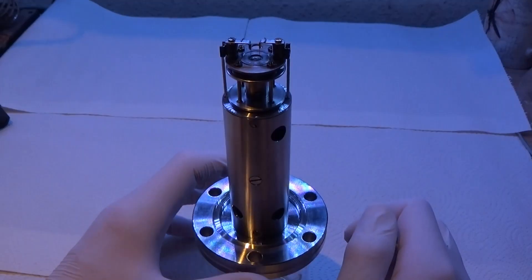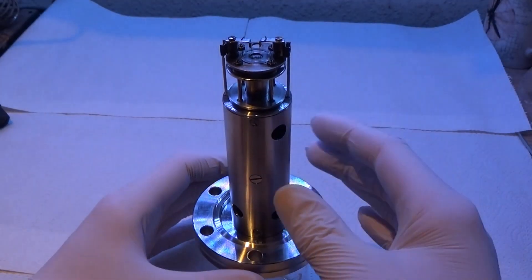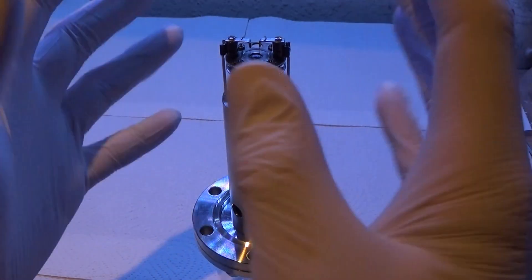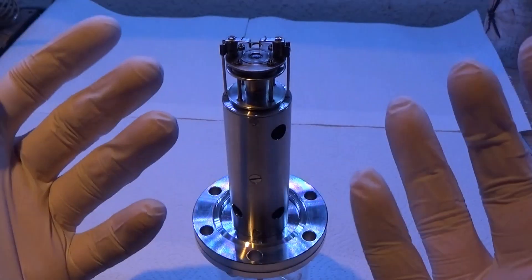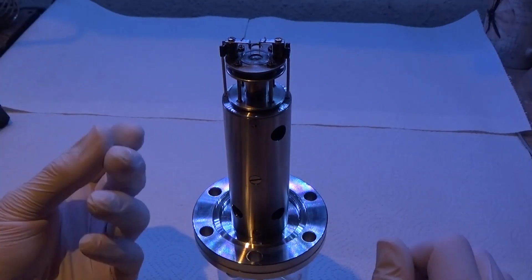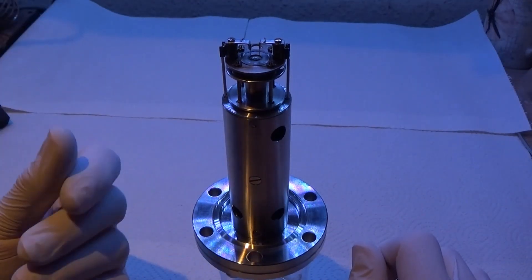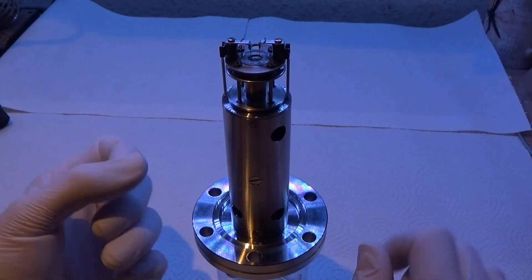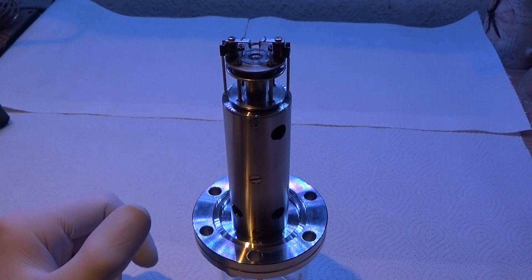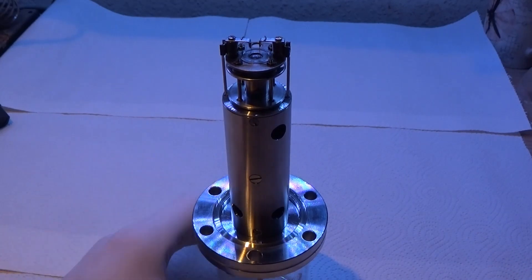But yeah, let's get into it. So this is pretty much exactly as the textbook says a mass spectrometer should look. By the way, when you work with this kind of thing, you really want to keep out your finger grease. That's why I'm wearing gloves. You should probably wear lint-free cotton clean room gloves. I don't have that. So let's hope everything is okay.